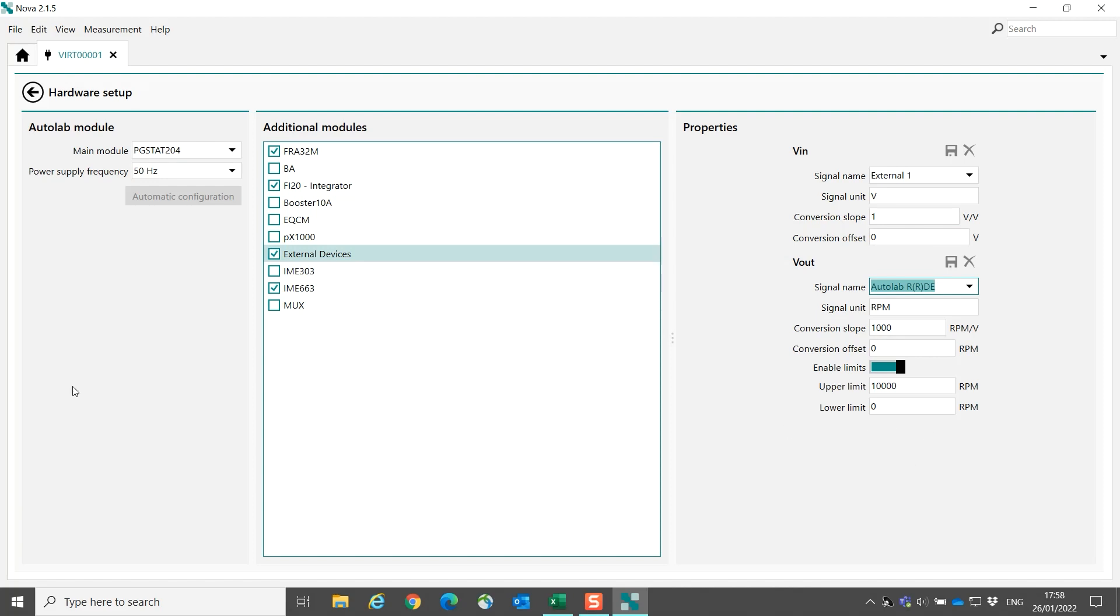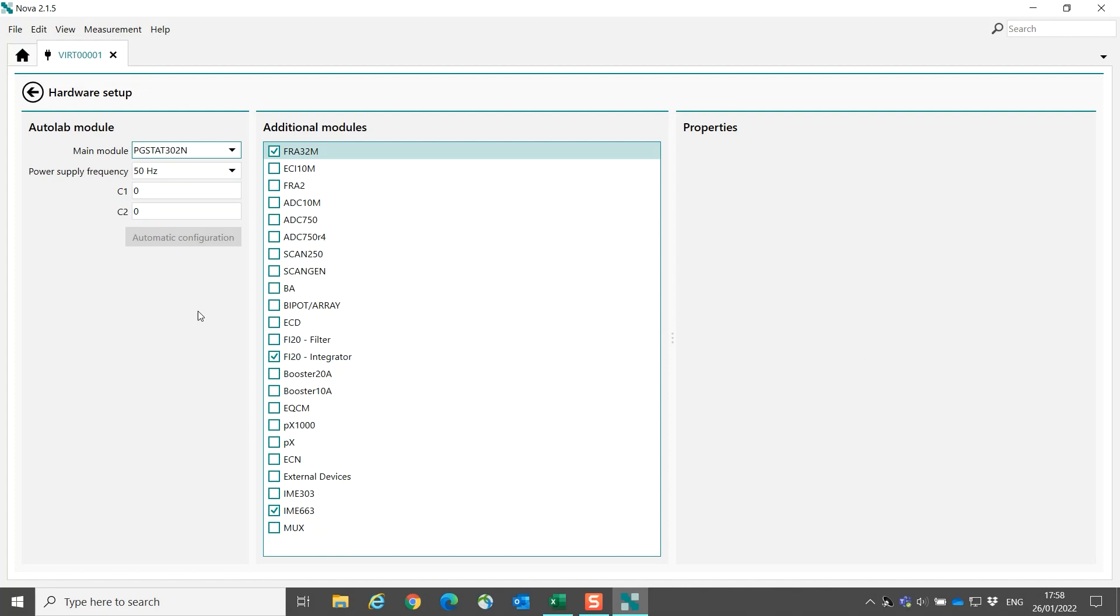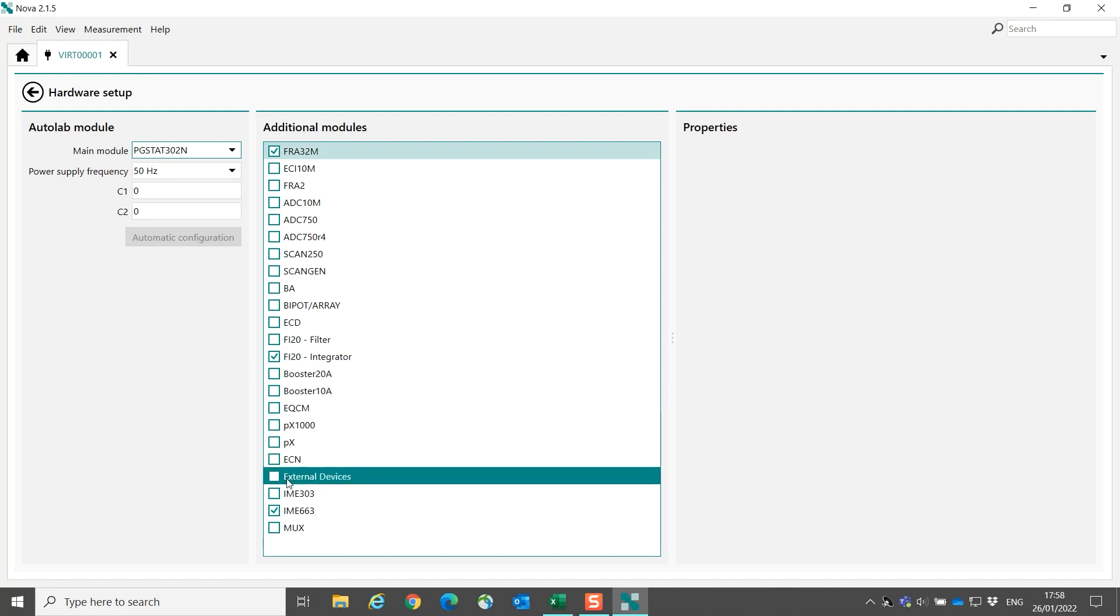When you have a PG-Stat 302N, for example, you also have to configure the external devices. But now the controlling goes through the DAC, the Digital to Analog Conversion 164, which is in all PG-Stat 302N instruments. Again, select the Autolab RDE.